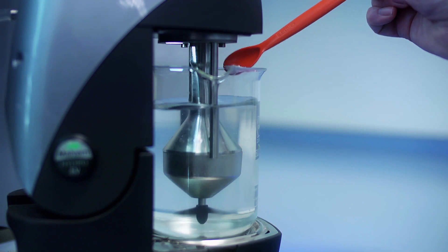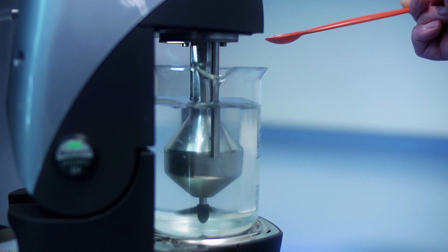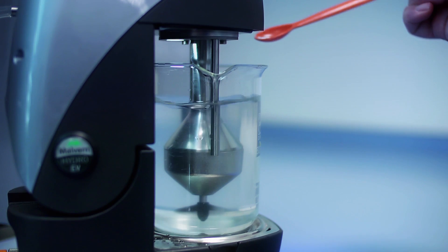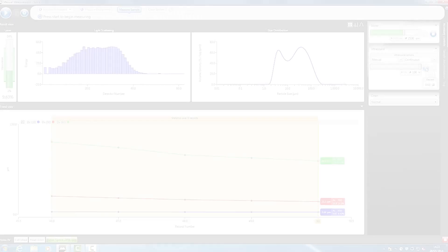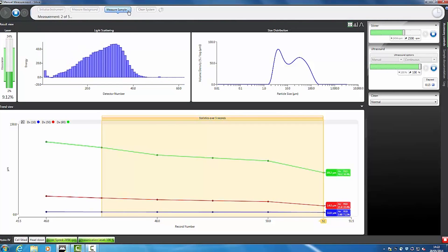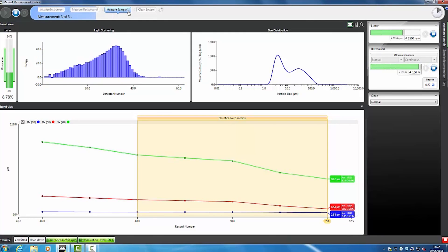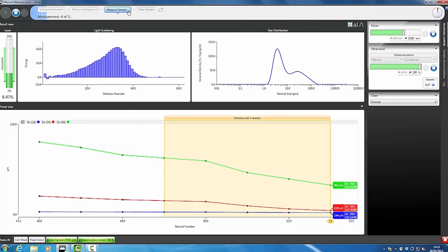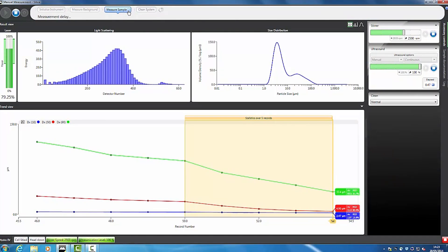Method development requires a user to select the optimum dispersion settings to achieve stable, reproducible results. Live feedback of the dispersion process quickly shows when the sample concentration is suitable for measurement. The process of sample dispersion during stirring and the application of inline sonication can then be followed within the measurement manager. This shows the decrease in particle size which occurs during dispersion until the size stabilizes and there are no more agglomerates.